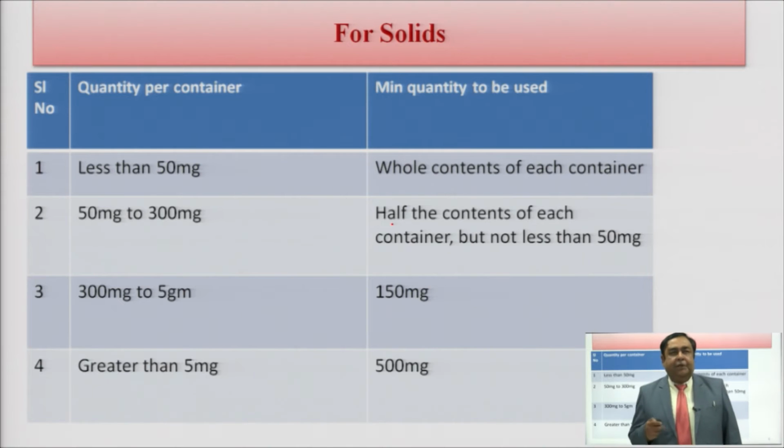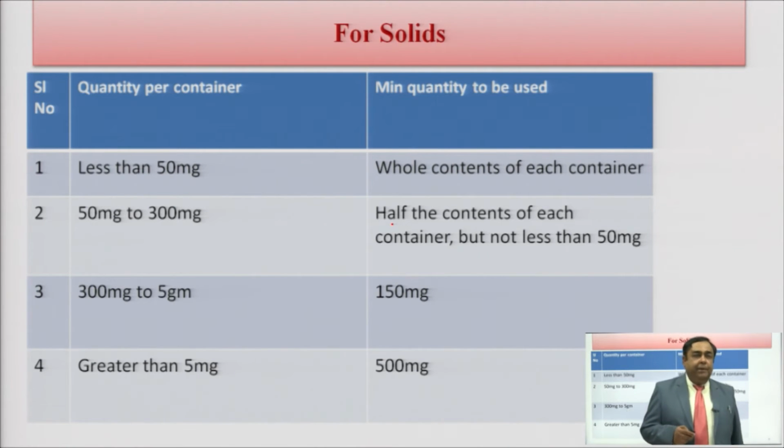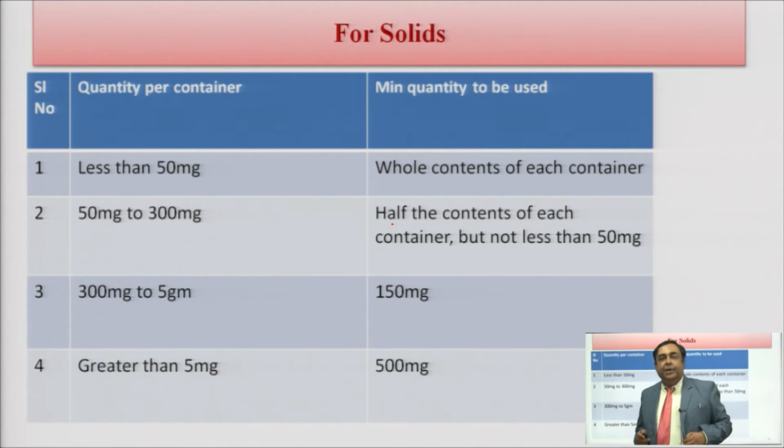If the quantity in the container ranges from 50 milligram to 300 milligram, you have to take half the content of the container, but please keep in mind that it should not be less than 50 milligram.